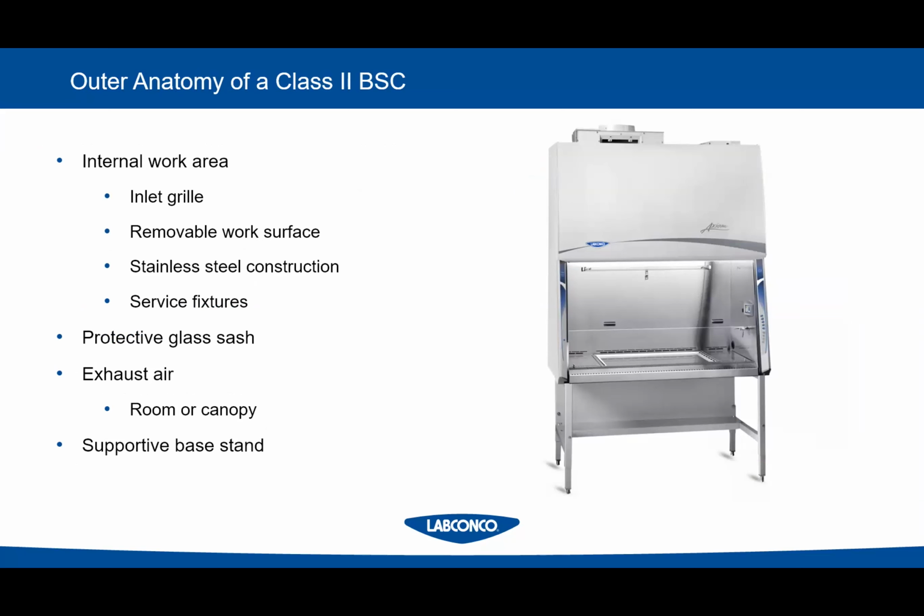Most of them are operated from a seating position. The reason for that is when a worker comes up to a biosafety cabinet, unlike a fume hood, they're going to probably be there for a while. When I used to work in one of these, I was there for about 3.5 hours at each stint. So I don't want to stand at a fume hood the whole time. So ergonomics can play a big role in how these cabinets are designed, right? Because they're there for comfort.